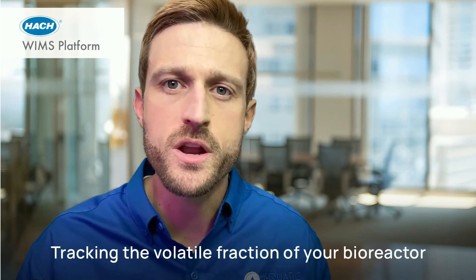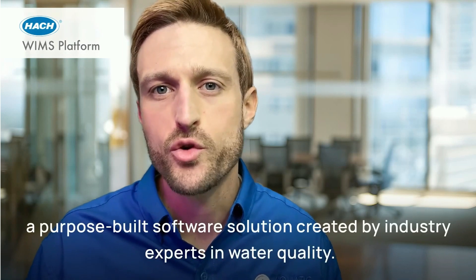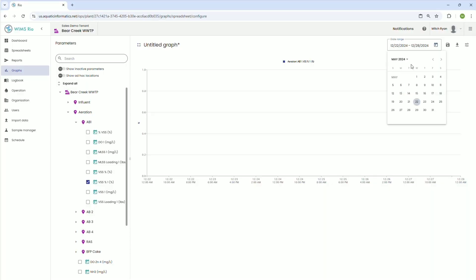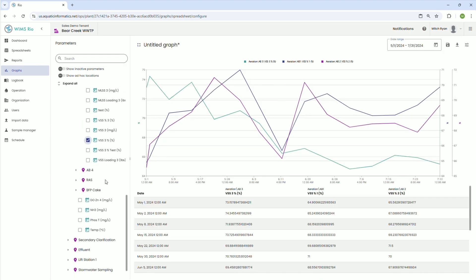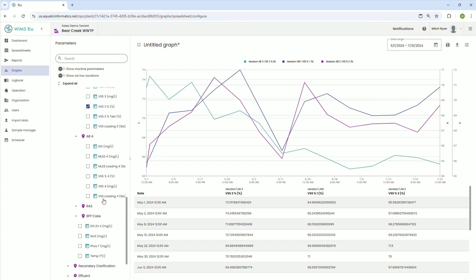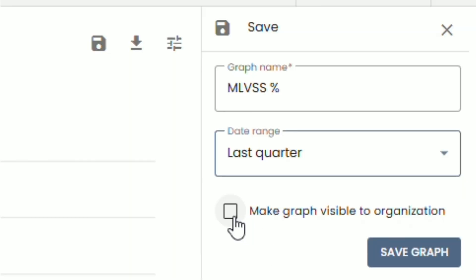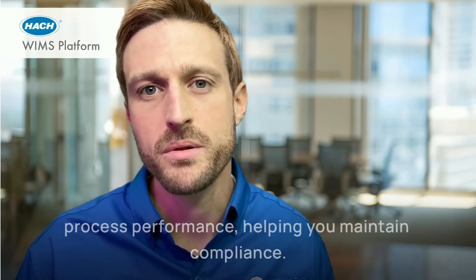Tracking the volatile fraction of your bioreactor is easy on the HawkWIMS platform, a purpose-built software solution created by industry experts in water quality. The platform enables seamless integration of your lab, your SCADA, and your operations data, allowing for complex data analysis with just a few clicks. The calculations are easy to set so you can track these changes over time and understand how changes correlate to process performance, helping you maintain compliance.